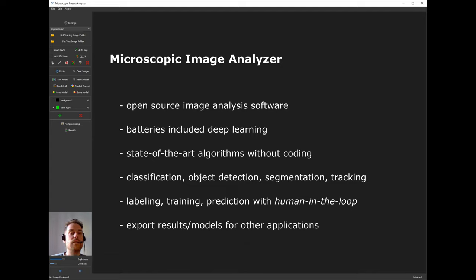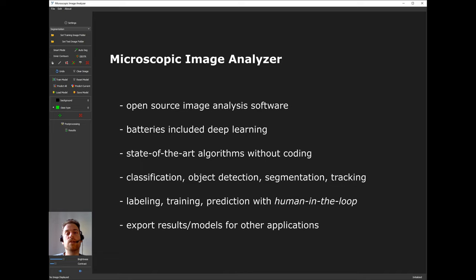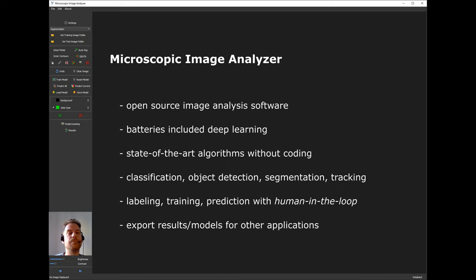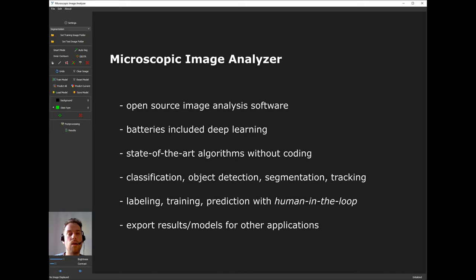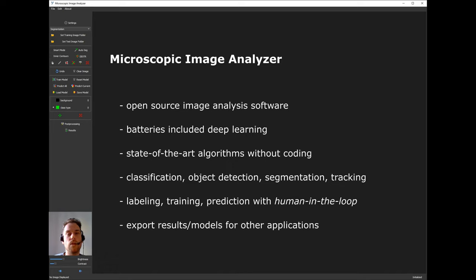There are several tasks that you can perform: image classification, object detection, segmentation. Segmentation is what I will show today. There's also the option for cell tracking. Furthermore, the software includes the labeling of images, model training with several training options, which model to train, different architectures and several hyper-parameters. Once a trained model, you can use it for predictions of unseen data.